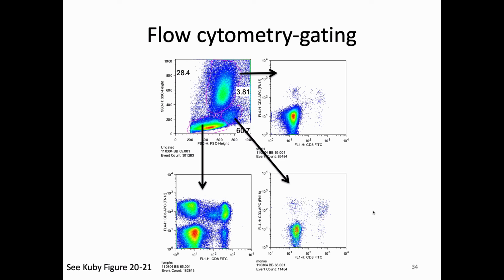And I would say, oh my gosh, these are CD8 positive, CD8 high, because they're far along the CD8 axis, but they're CD3 negative or CD3 low, because they're low on the CD3 axis. These are CD8 positive and CD3 positive. These are CD3 positive and CD8 negative. These are CD3 negative and CD8 negative. And I could, if I had gates drawn on there, get percents of each of them and further analyze them and just go to town.